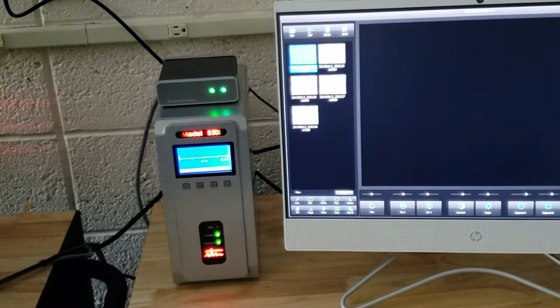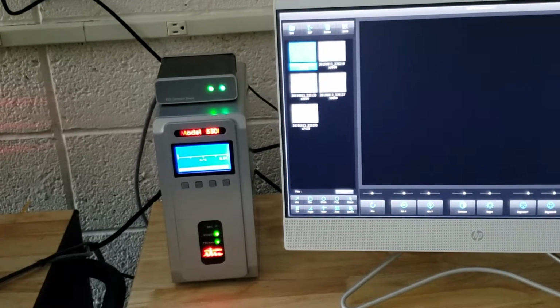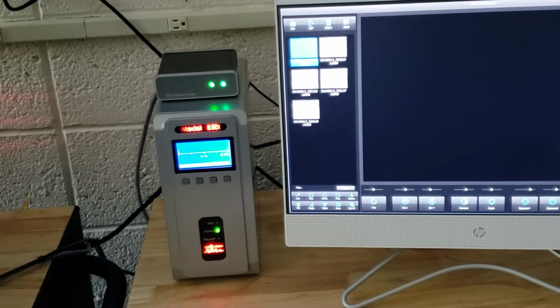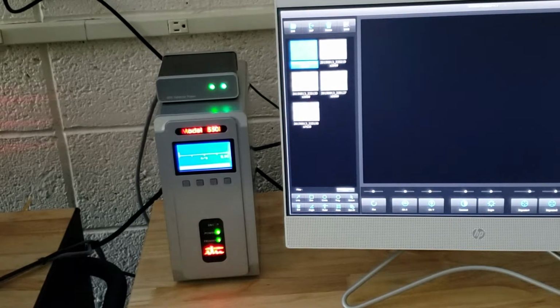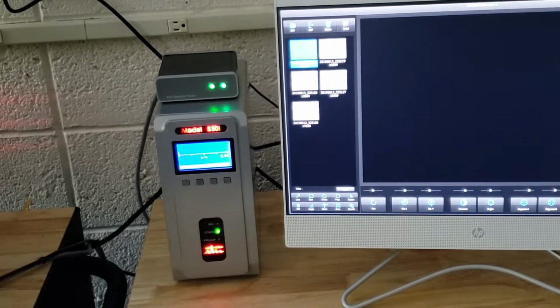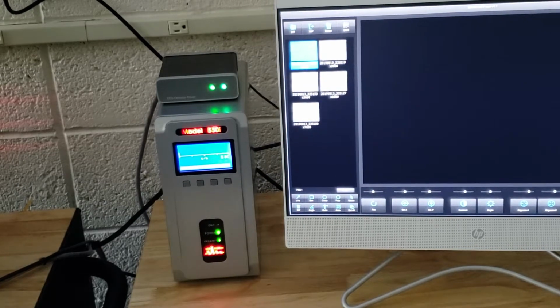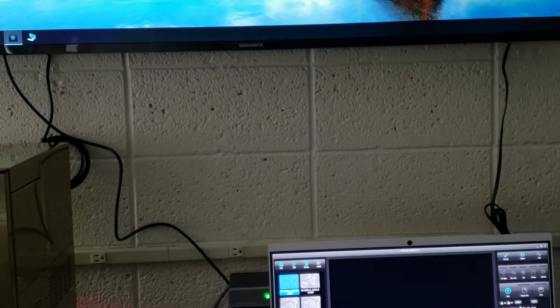Okay, we're not communicating with the hardware then. Let's reset the software bundle, because that tells me immediately if the software's talking to the hardware, because it's actually telling it to do something instead of looking for information. So it's very important for me and for whoever I'm troubleshooting with. It's good just to know that they're there, they all have a feature and a function, and I know what they are. You guys don't have to know what they are, but for troubleshooting, I'm going to reference it. So far, so good. That's why I kind of hide it in the back of this, because realistically, you don't need to know what's going on, right?